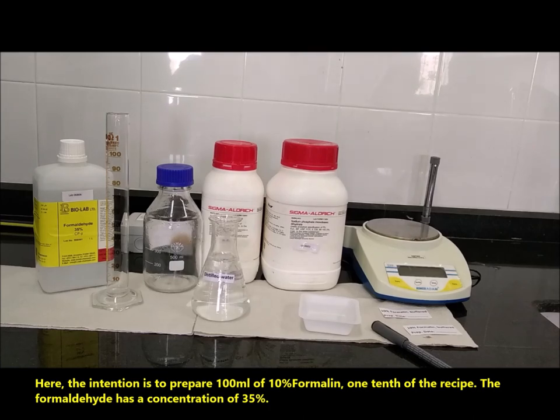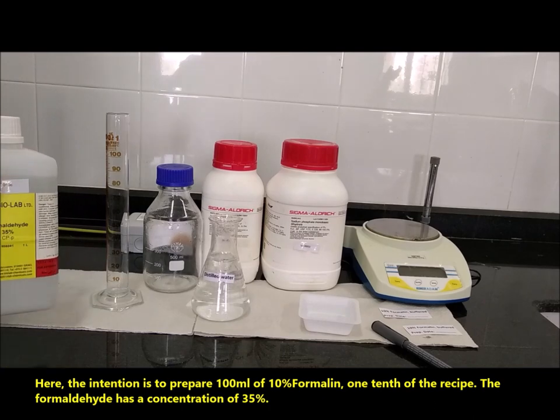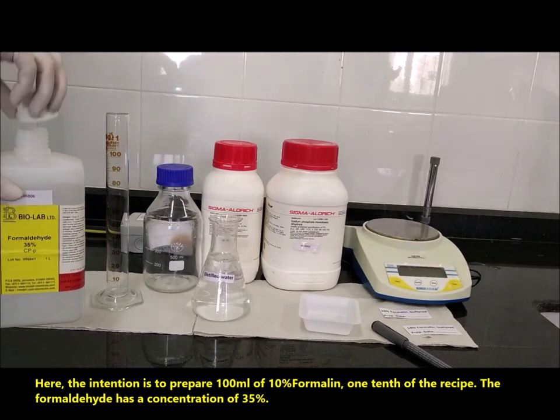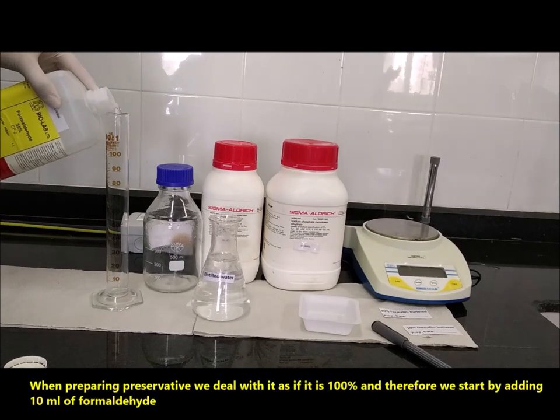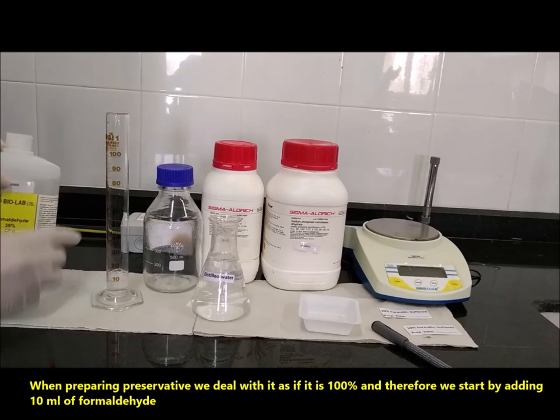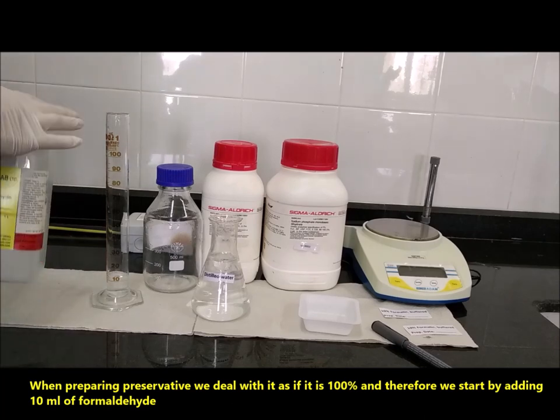Here, the intention is to prepare 100 ml of 10% formalin — one-tenth of the recipe. The formaldehyde has a concentration of 35%. When preparing the preservative, we treat it as if it's 100%, and therefore we start by adding 10 ml of formaldehyde.